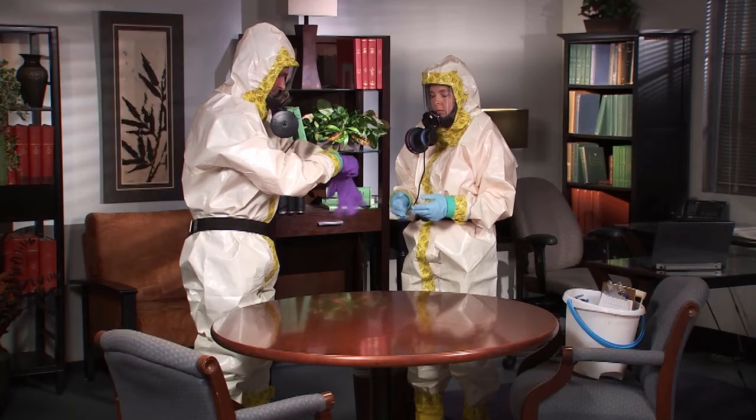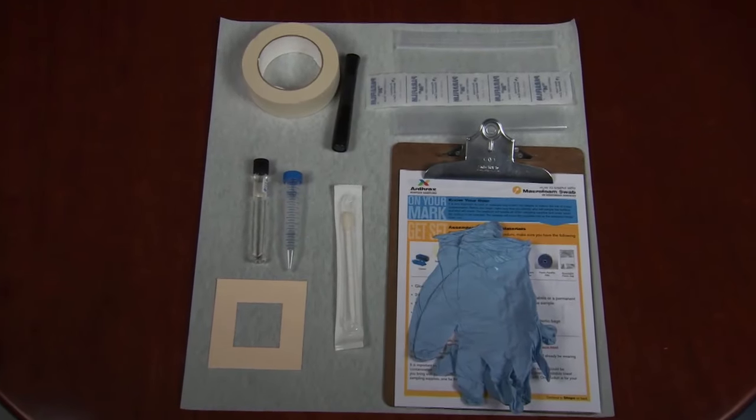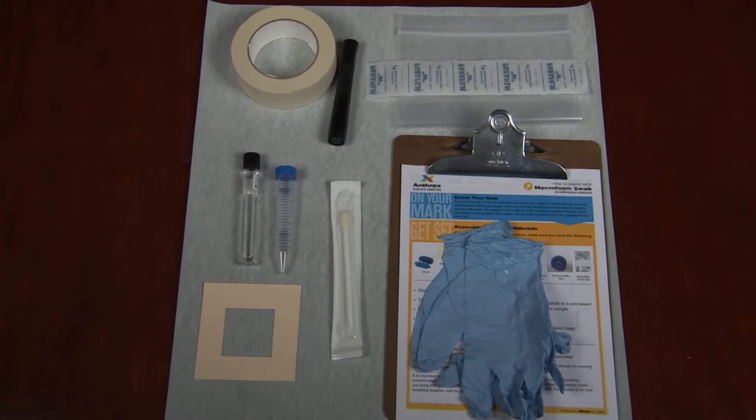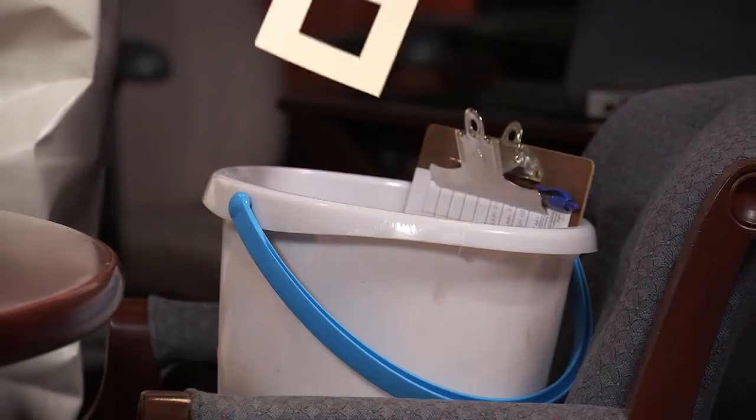While in the contaminated area, you should keep your supplies on clean surfaces. This can be done by working from 5-gallon buckets or off clean, disposable towels that you bring in with you. We will now demonstrate and explain how to collect a sample.